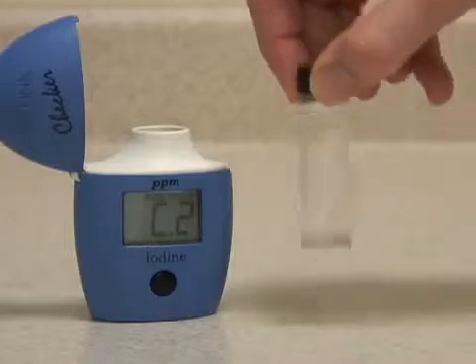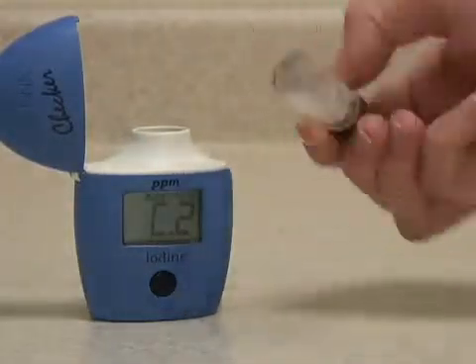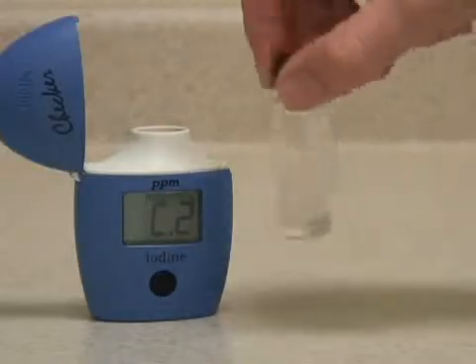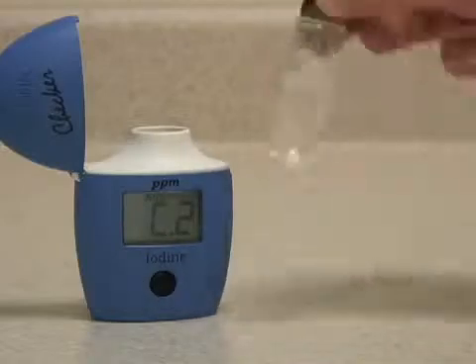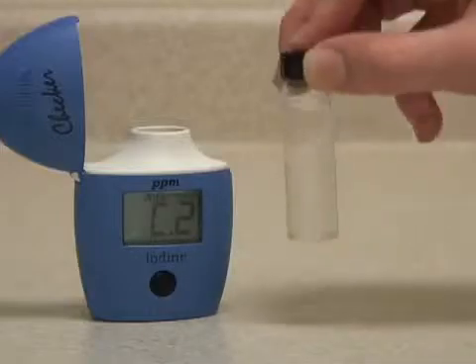Replace the cap and mix the sample with reagent by gently swirling and inverting the vial. Try to avoid shaking the vial too much as this will introduce micro-bubbles which can alter the reading.